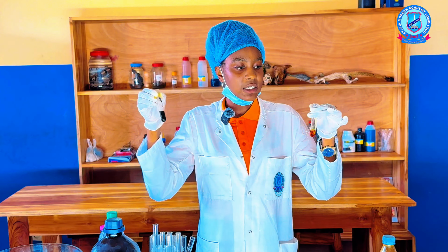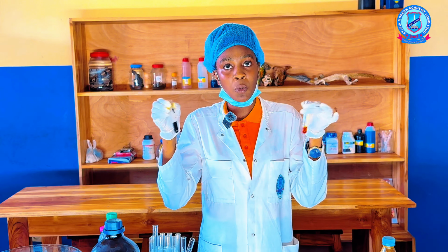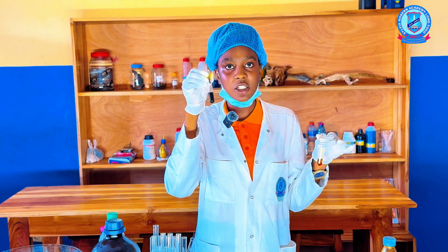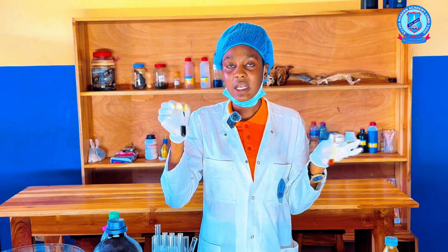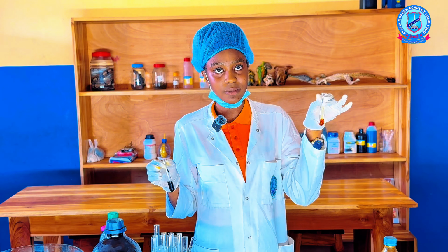Between our first experiment and our second experiment, we see that there is a color change in one of them. In our first experiment, we see that the color has changed to blue-black, and the second experiment has no color change. So this shows that our first experiment has starch present in it, and the second one has no starch present in it because it is protein.